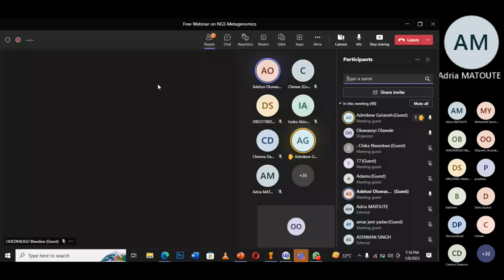and metagenomics. Yes. I'm just asking, we can do both. We can evaluate the antimicrobial resistance and virulence factor at the same time. Yes, at the same time. Definitely, with both analyses. With both whole genome sequencing and metagenomics. Yes, you can do it from whole genome sequencing, and you can do it from metagenomics.